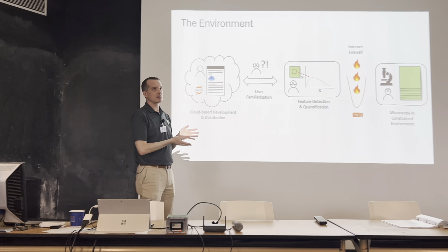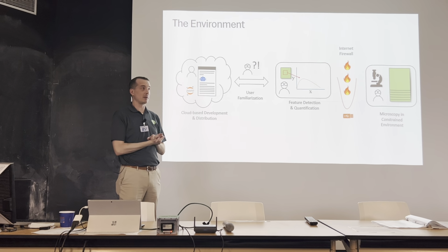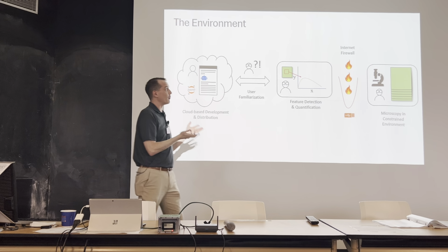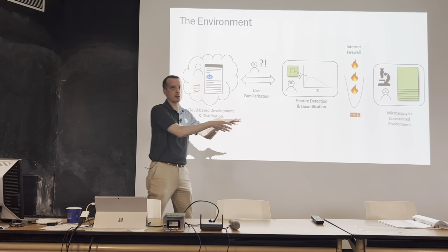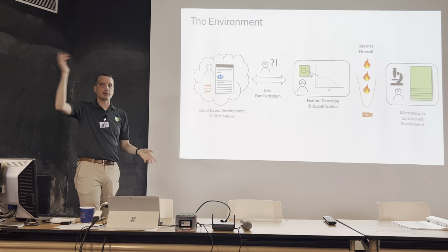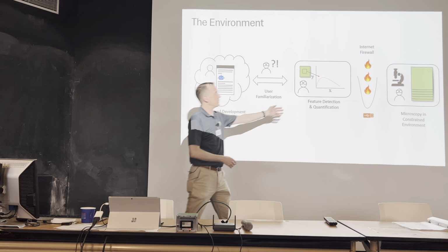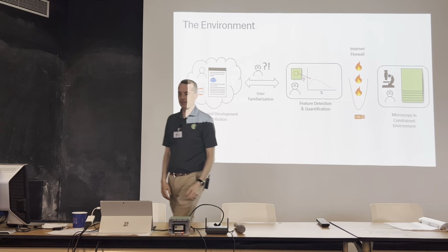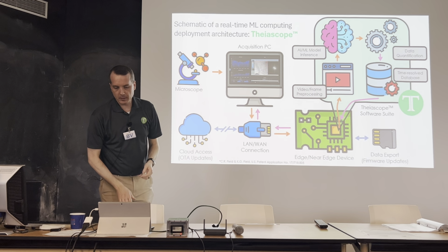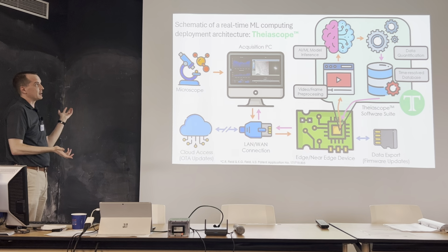That computer probably doesn't have an AGP port of quality to put a GPU in there. So you need some other way to bring these cloud resources to the microscope, as opposed to trying to bring the microscope to the cloud. That will then allow you to run the models and do the feature detection and avoid having to deal with the sneaker net with your thumb drive. So with that, we created the Theiascope platform, or what we call Theiascope.